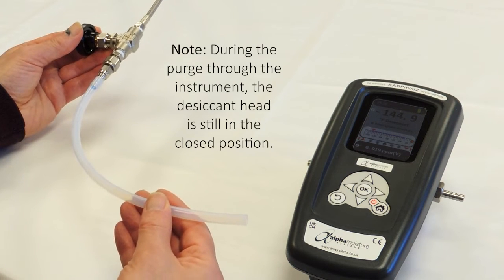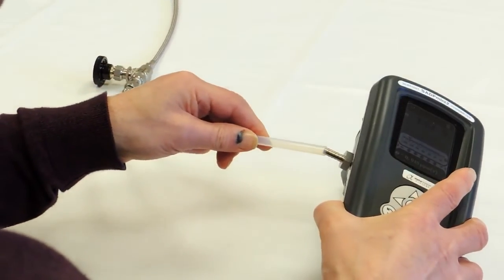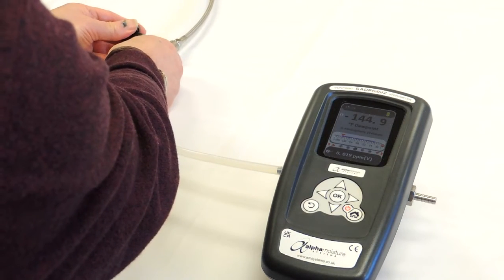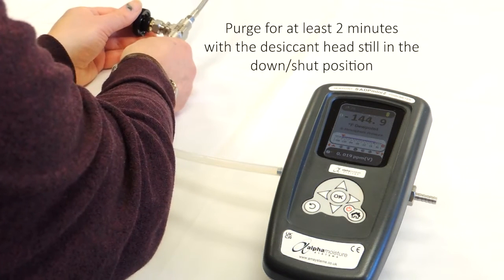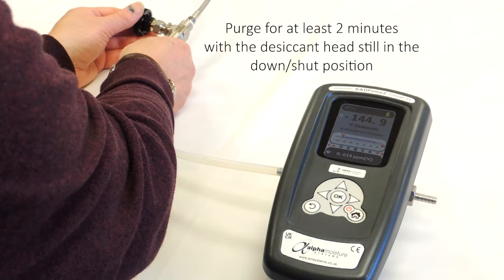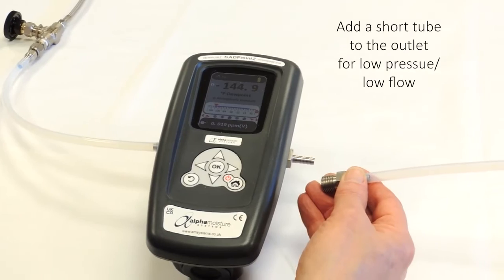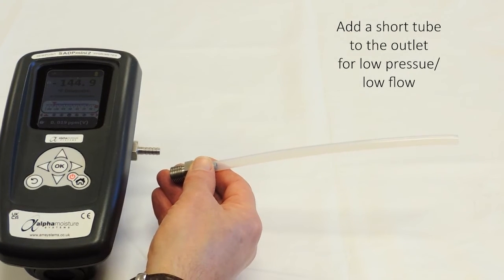After finishing the purge through the sample line to atmosphere, we are going to connect the tube to the Mini 2 using the PTFE connection on the side by pushing the pipe on like this. It doesn't matter which side it is connected to — the flow can be in either direction. We are then going to open the valve to purge through the instrument for at least two minutes. When opening the valve, be very careful not to over-pressurise the head. Pressure must never be above 0.3 bar G or 4 PSI G in the head of the SADP Mini 2. For low pressure or low flow rate applications, ensure that there is a short length of PTFE tube on the outlet of the instrument as well. This prevents any back diffusion of moisture from the ambient air into the measurement head.